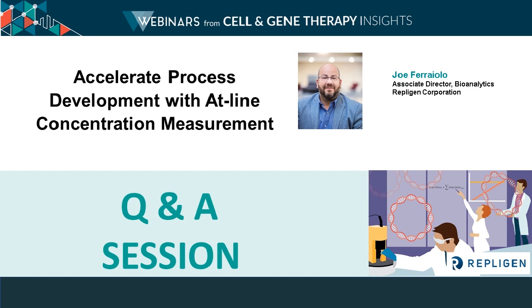Okay, so the first question I've got here, Joe, is regarding AAV concentration, full empty ratio. I would imagine that the technology could measure partials, is that right? Unfortunately, no. UV is not a selective enough technology to distinguish a partial versus a full, rather than just the total content of what is there.